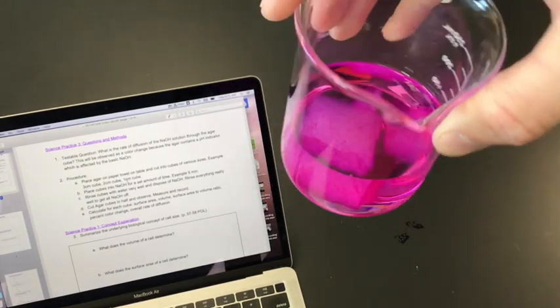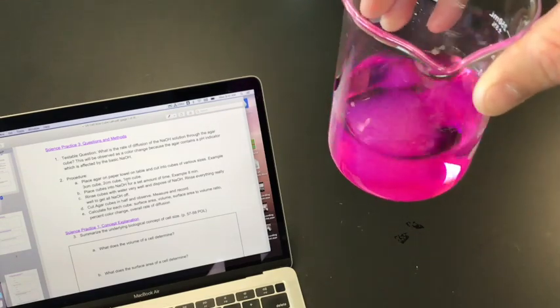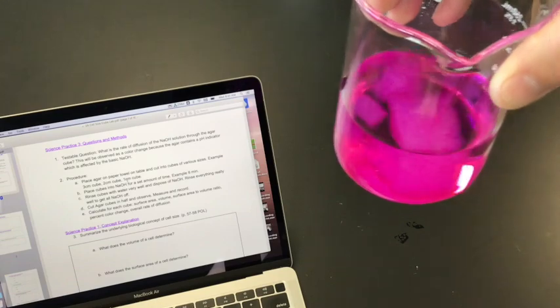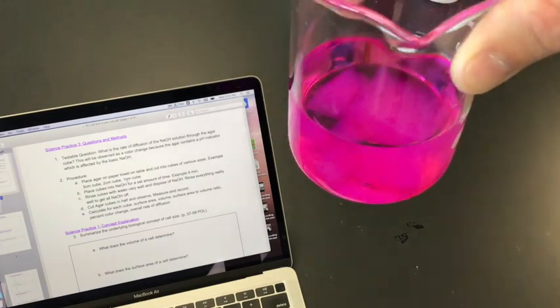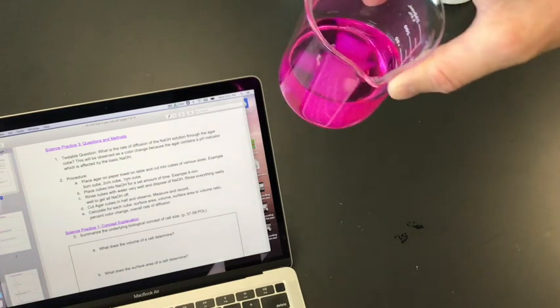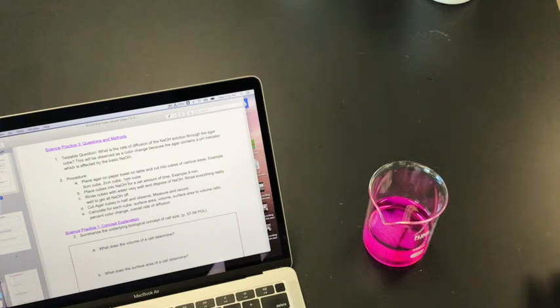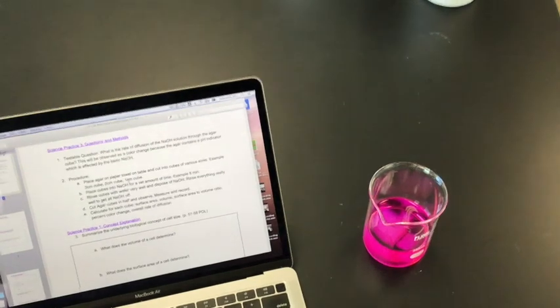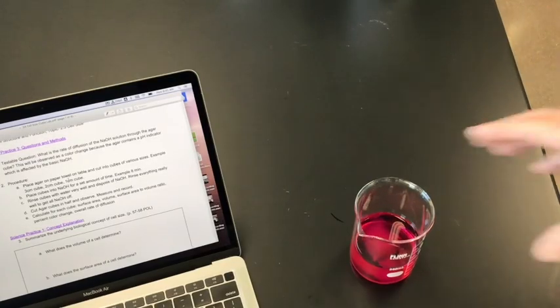All right, so as you can see, color change is already occurring and the solution is pink, but also the solution is going to be going through the process of diffusion, diffusing through the cubes. After eight minutes, I'm just looking at the time now, I will go ahead and remove the cubes and follow the rest of the procedure. Okay, I went a little longer, I went about ten minutes on this. I'm gonna go ahead, go to the sink and rinse out the solution.